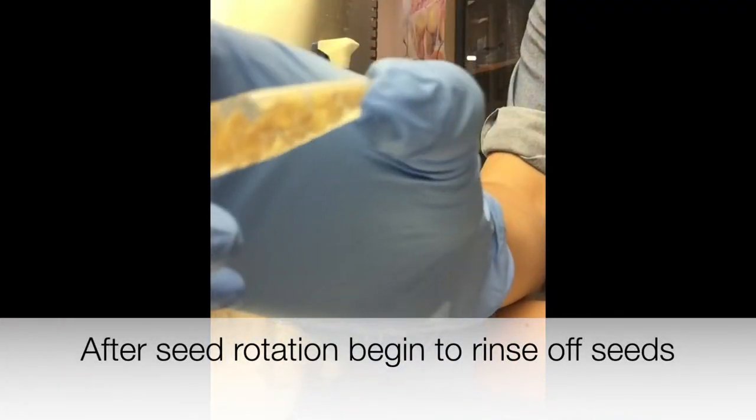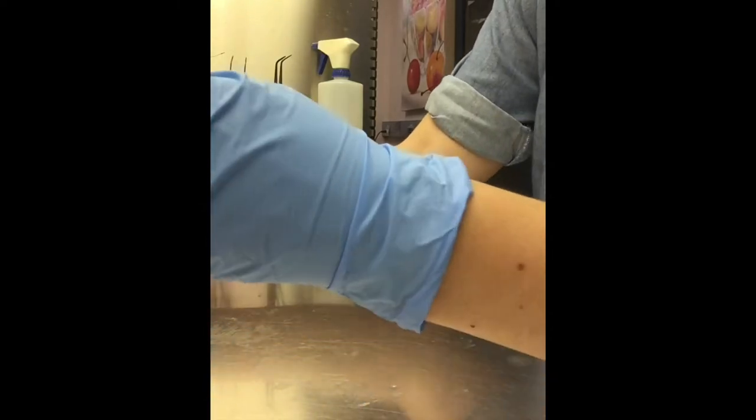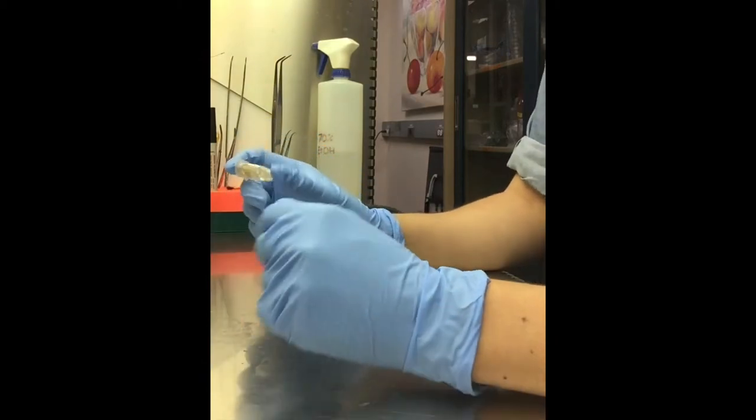Seeds are in the tube, and we want to keep switching them to different tubes because we want to get as much bleach out of it as possible.